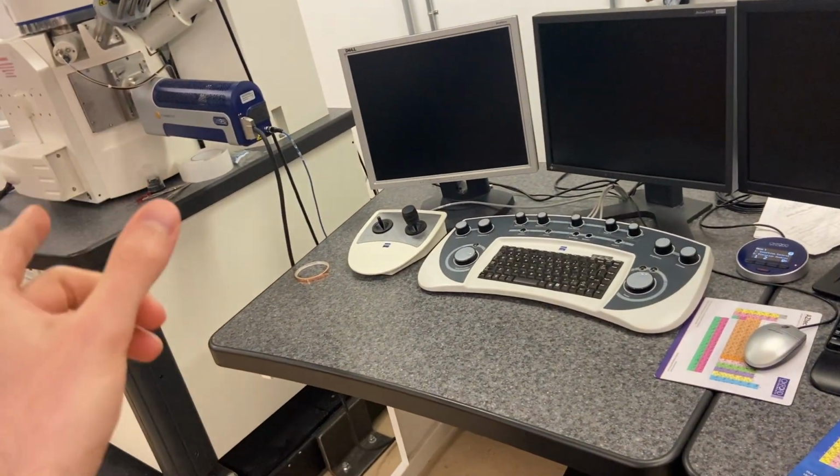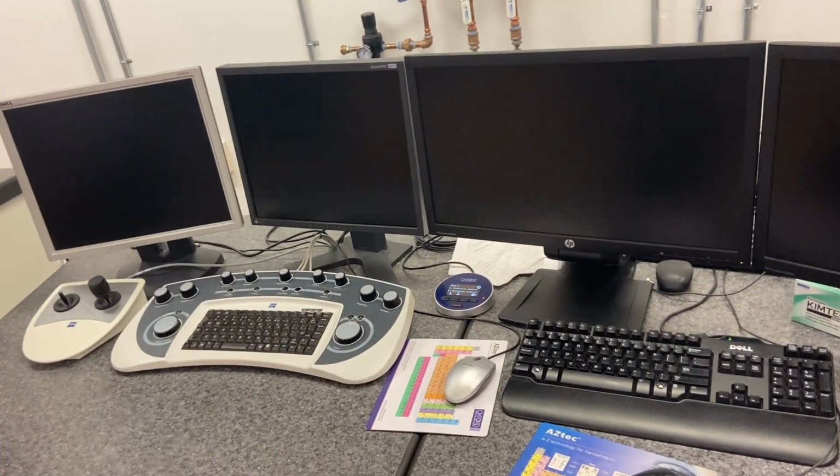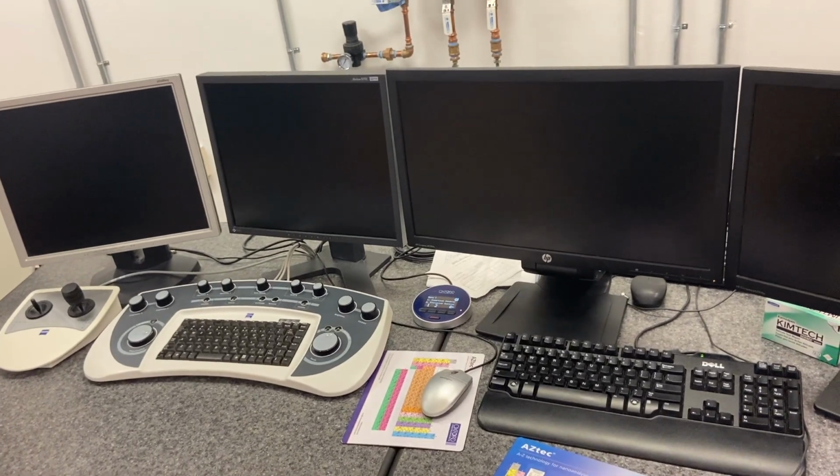So I'm just going to do a quick jump cut to when I actually load the holder into the chamber, and I'll have a video of that. And then I'll go into when I'm actually on the instrument. So let's do the jump cut right now.